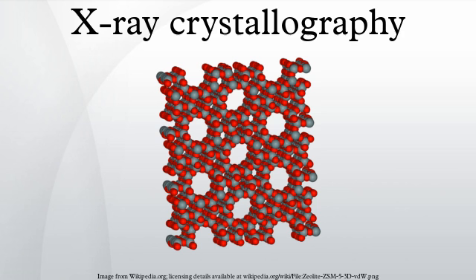In the third step, these data are combined computationally with complementary chemical information to produce and refine a model of the arrangement of atoms within the crystal. The final, refined model of the atomic arrangement, now called a crystal structure, is usually stored in a public database.